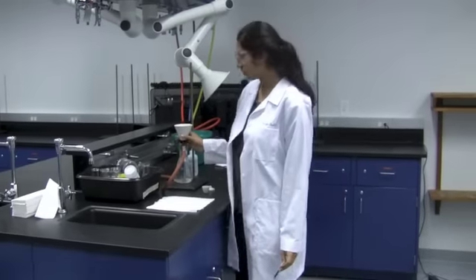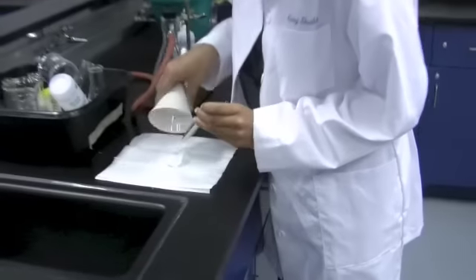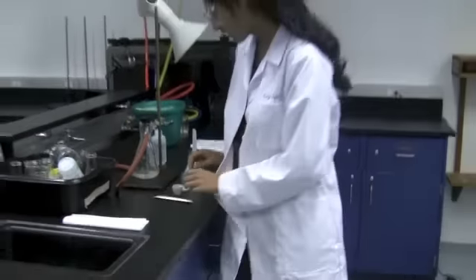After you wash your crystals, you want to transfer it to paper towels to dry. Make sure you label your name and save it for next time. The last step is to weigh out your crucible and the cover, and make sure you do it to 4 decimal places and record in your lab notebook.